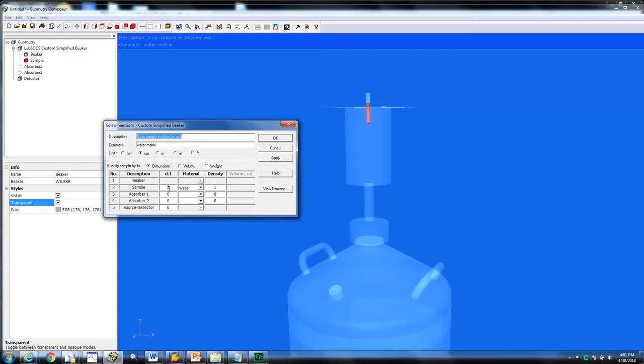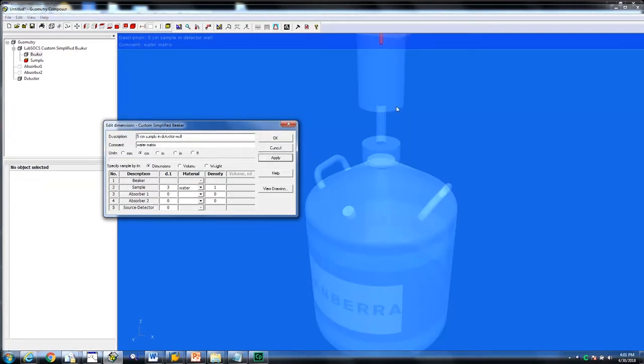For this example, we will change 5 cm to 3 cm. Click apply to see update. Click OK to close the dialog window.